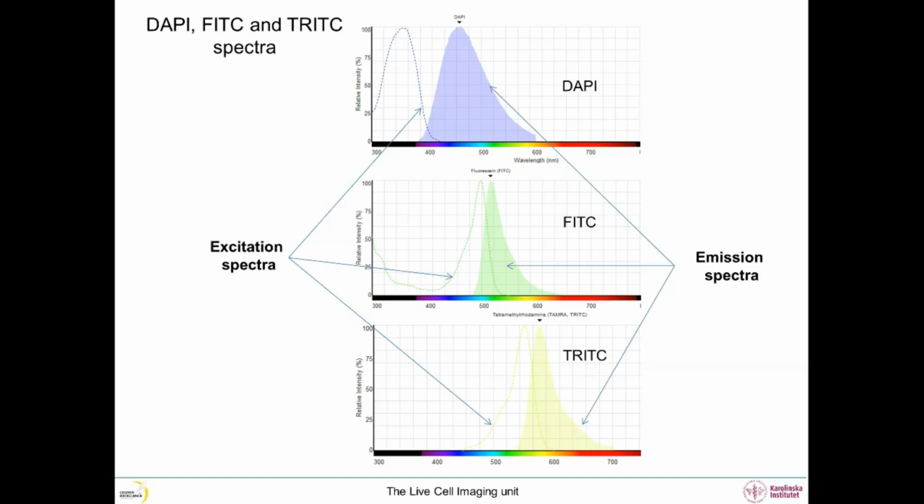When the fluorophore is excited, it absorbs light at wavelength, shown by its excitation curve. The electrons in the fluorophore get excited and they start vibrating. These vibrations lead to a loss of energy. The molecule then goes back to a more stable state by releasing energy in the form of a photon. This is fluorescence. The emitted photon has a lower energy than the absorbed photon because of the energy lost in the vibrations. This is the reason why the light emitted is shifted towards the right side of the spectrum, towards longer wavelengths, which are less energetic.